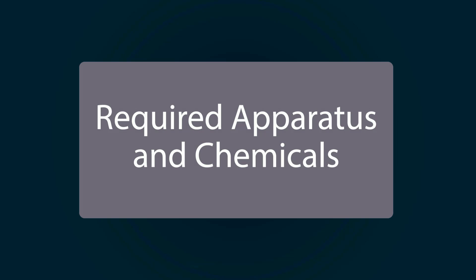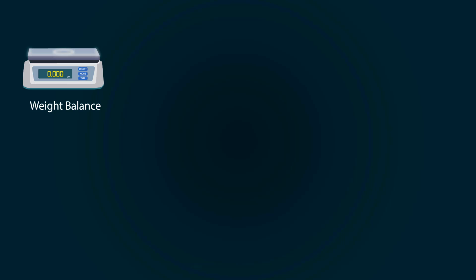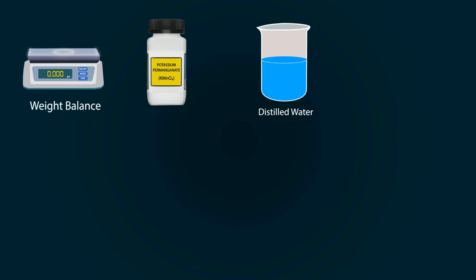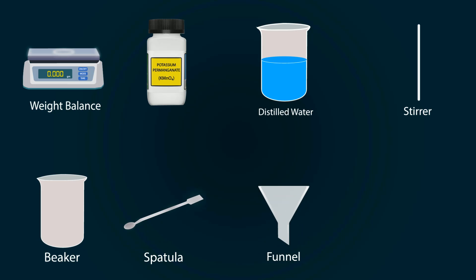Required apparatus and chemicals are: a weight balance, potassium permanganate, distilled water in a beaker, stirrer, empty beaker, spatula, funnel, and a volumetric flask of 1000 milliliters.